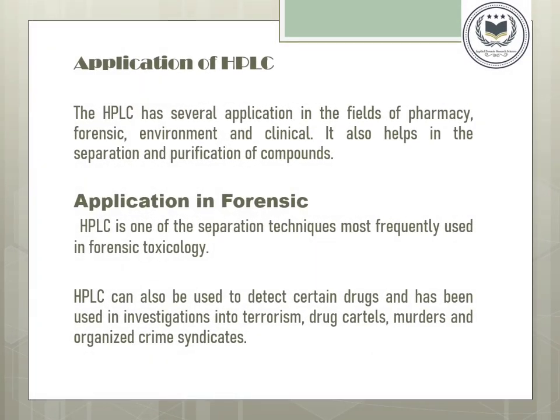Then applications of HPLC. HPLC has several applications in the fields of pharmacy, forensic, environment, and clinical. It also helps in the separation and purification of compounds. Then, application in forensic. HPLC is one of the separation techniques most frequently used in forensic toxicology. HPLC can also be used to detect certain drugs and has been used in investigations into terrorism, drug cartels, murders, and organized crime syndicates.